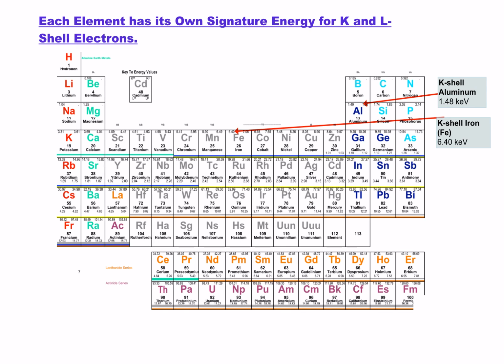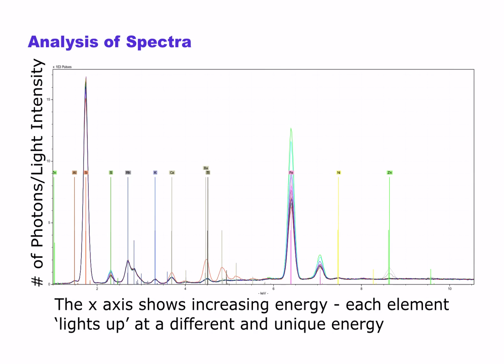Now that's why, in the periodic table, each element has a different fluorescence energy. As you add protons, you add attractive force, and thus you add the energy needed to shake one electron to another energy state. Our spectrum typically looks like what you see here.